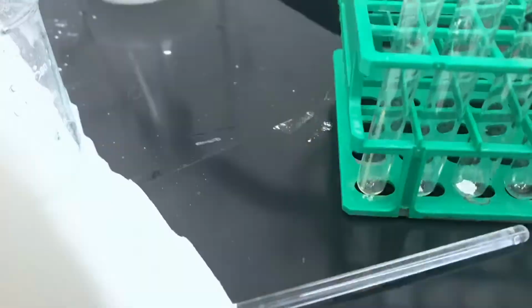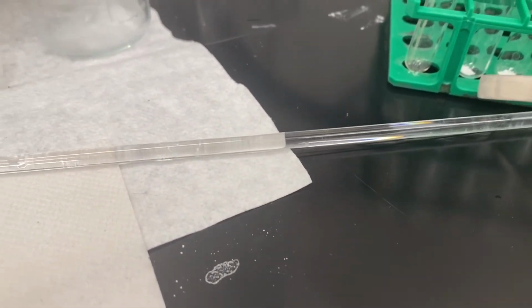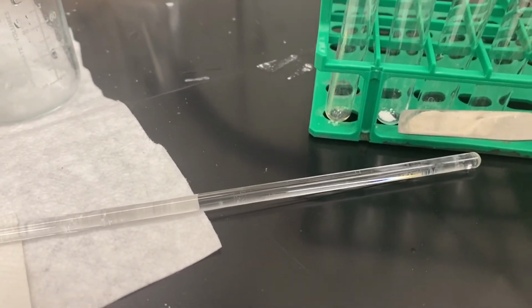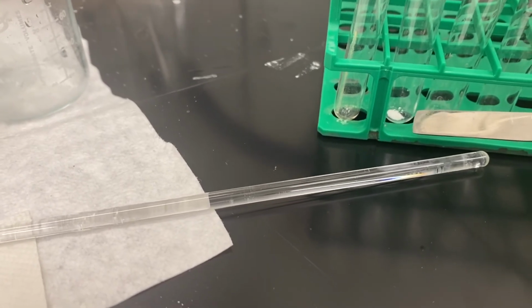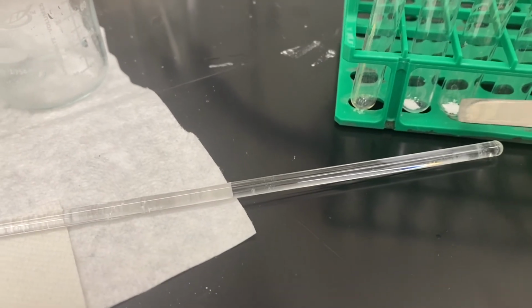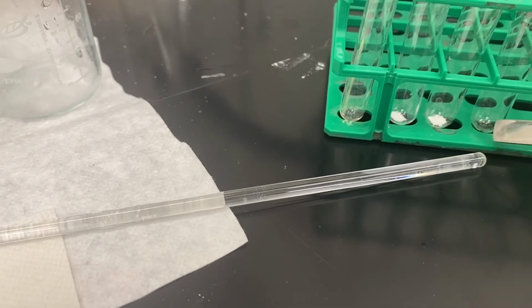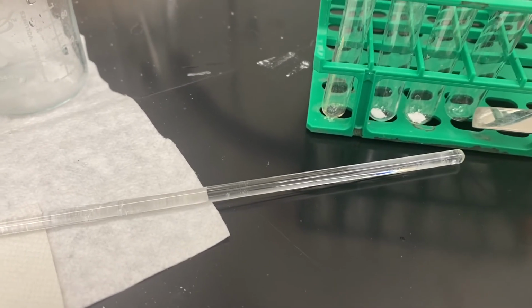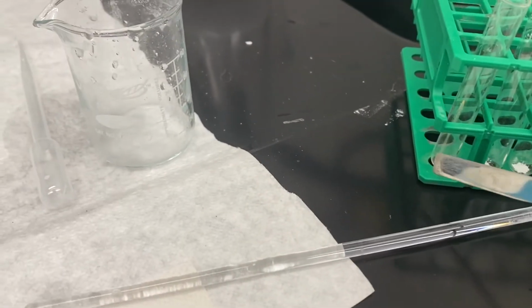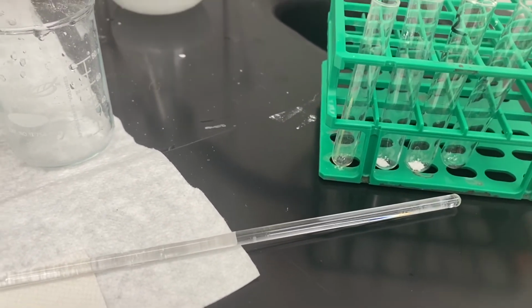And I'll go over this in a little bit, but when we do our iron analysis, this sample here, this first one, is going to be our sample right after the reaction. So it's essentially like our crude sample, or sample of the crude product. This one is going to be the one we just filtered off. This is going to be the one where we separated out that unknown impurity. And then this last test will be for our recrystallized sample. The first one will be for our control, so we can see what the iron should do when it tests for phenols.